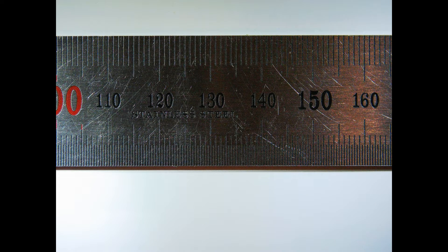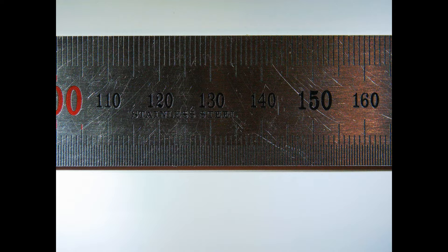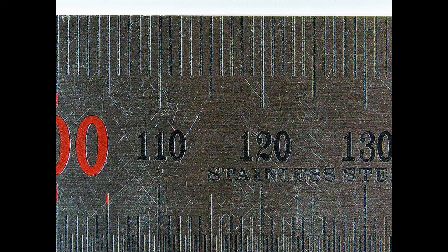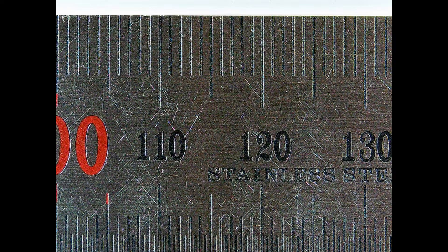The camera reports a digital zoom of 3 times, but that is incorrect. From a 65mm image at minimum to 32.5mm at maximum is exactly 2 times instead of 3.